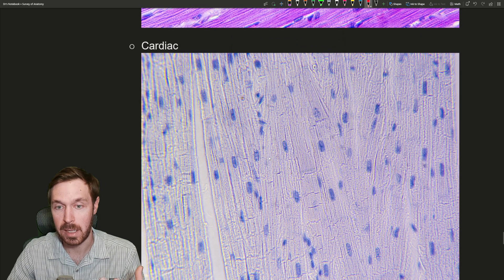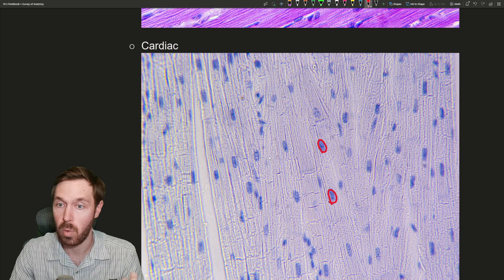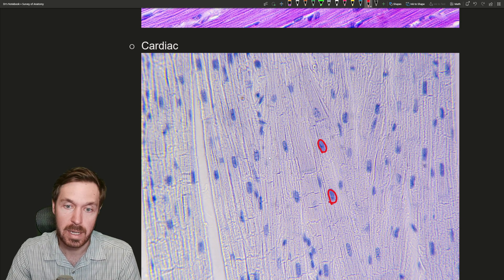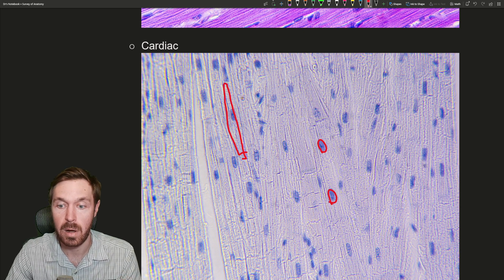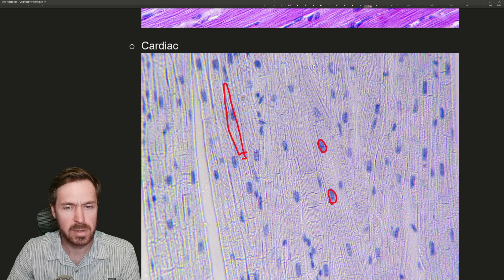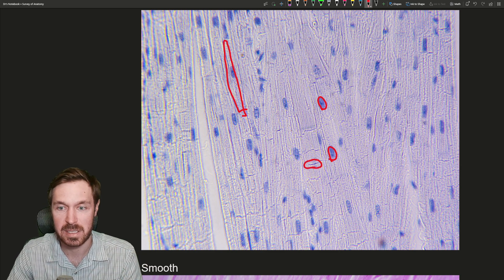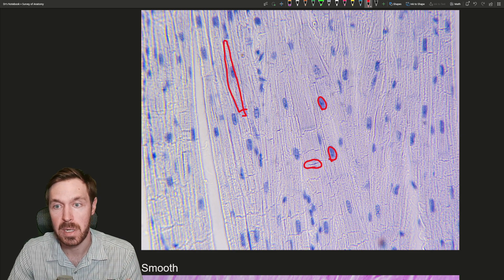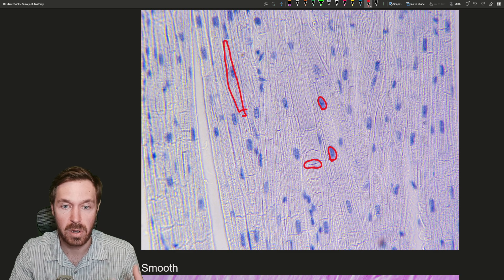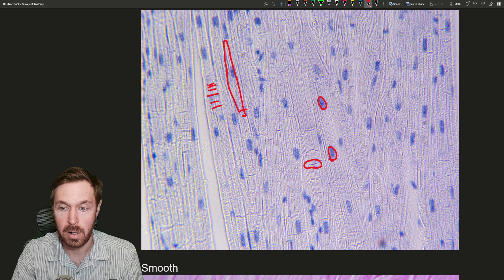Cardiac muscle is involuntary, and these cells have only one nucleus. They are shorter cells compared to the very long skeletal muscle cells. An important feature to look for — this image is stained blue specifically to highlight the intercalated discs, which are gap junctions that allow cardiac cells to communicate instantaneously with each other and allow your heart to beat as a unit. Cardiac cells are also striated, and if you look closely you can see those striation patterns on this cardiac muscle as well.